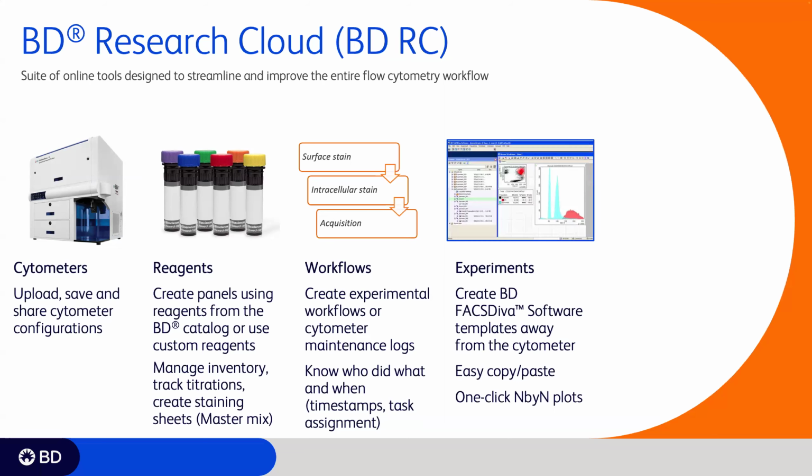You can also create FACSDiva experiments directly in BD Research Cloud so that you don't have to wait for your turn on the cytometer to set up your experiment ahead of time. So when it is your turn to go to the cytometer, you're ready to go, and you already set it up through BD Research Cloud.